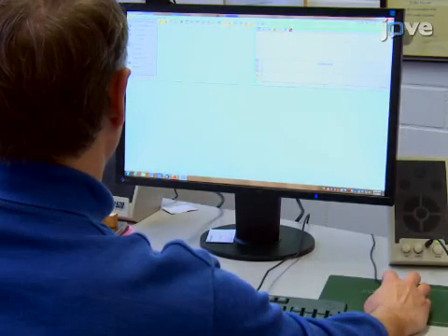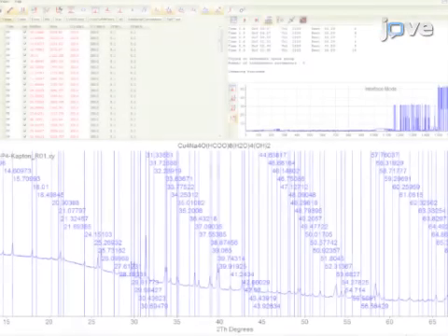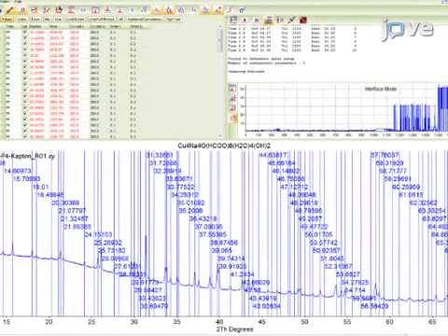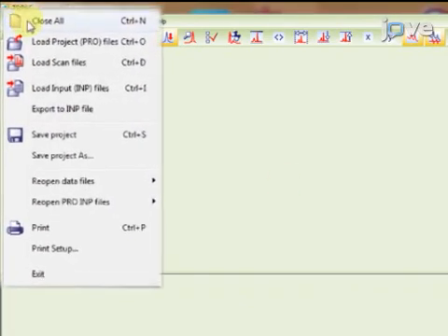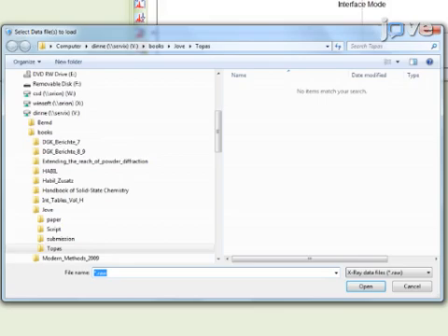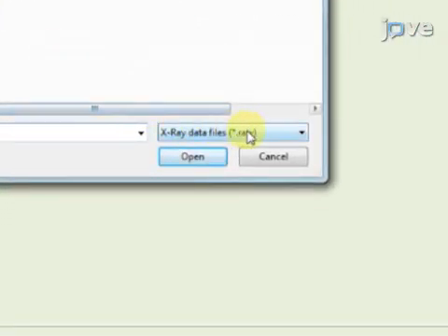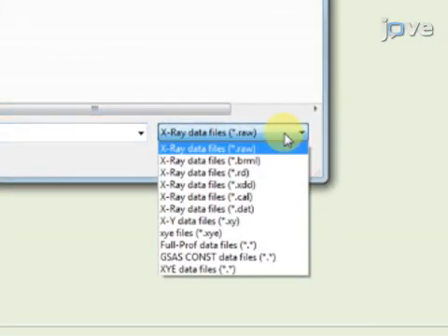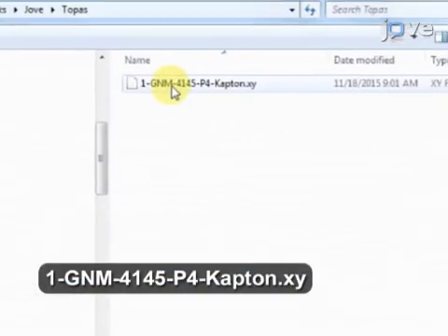The next step is to perform an automatic peak search using the first and second derivatives of Savitzky-Golay polynomials of low order. Start the software program by double-clicking the icon, then click Load Scan Files. Using the pull-down menu, select XY Data Files, and then double-click on the appropriate file.